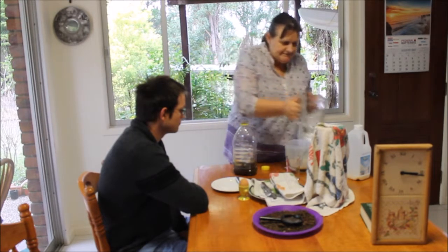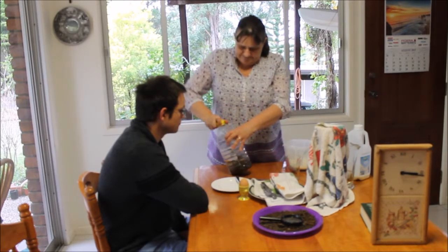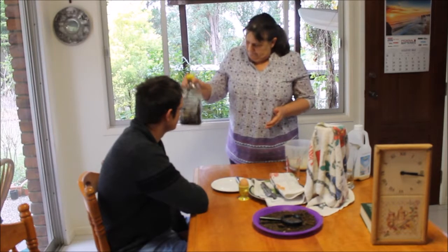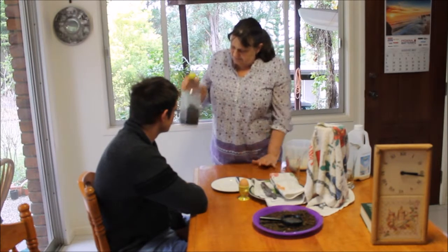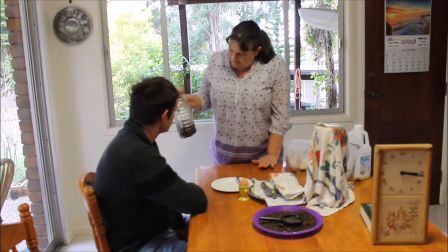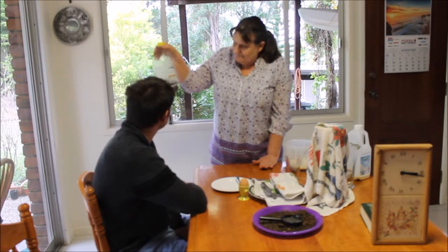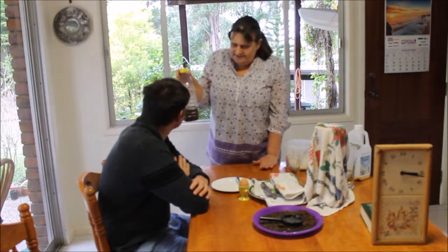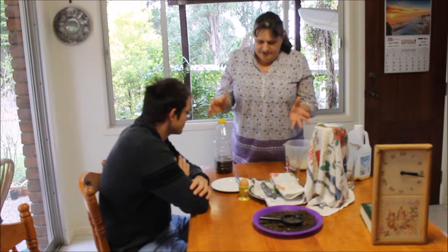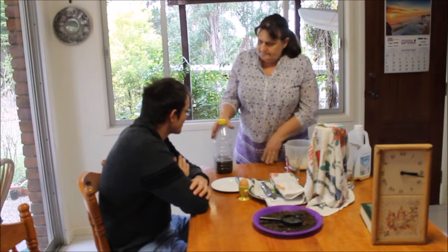Here we go. Let's give this a good shake. What have we got here? What can you see now? Before we had dirt down the bottom, and we added water, and now we've got muddy water. Very murky water. Yeah. That's right. And so we've got soil and we've got water, and we've mixed them together to make muddy water. Do you think we'd be able to separate them again?